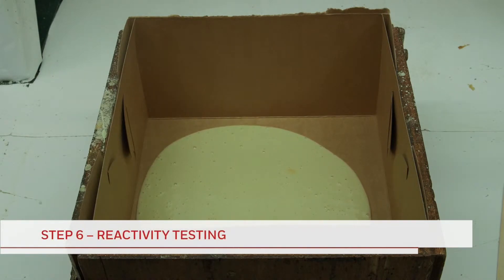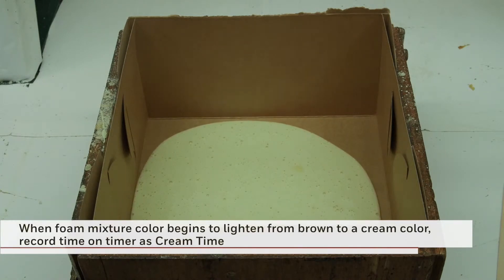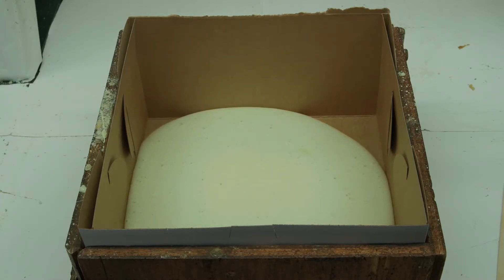Next, the reactivity of the foam mixture is tested. First, you can record what is known as the cream time. When the color of the foam mixture lightens from brown to a cream color, the time on the timer is recorded to indicate the cream time. Cream time will vary depending on the type of formulation and the catalysts used. In some fast-reacting foam, the cream time may be instantaneous.